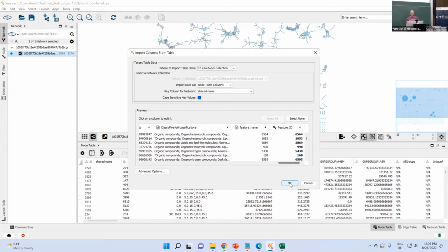And then I just hit OK, and then it imports it. Because these tables become very complicated, because there are so many different columns, what I did also the other day, I concatenated a new header name where I put in a prefix Canopus to each of the columns that came from Canopus. I would suggest that you do something like that.